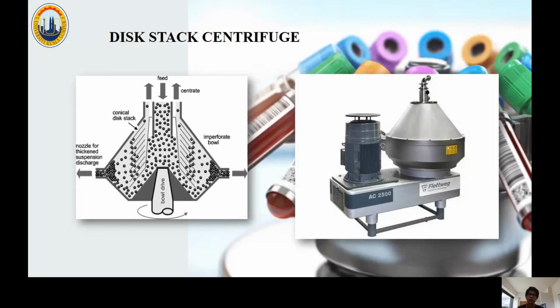The picture on the right shows how this disc stack centrifuge looks like in real life, and the other picture shows the process inside it.